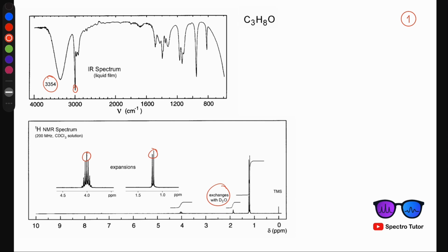From there, if we have the IR spectrum, that's our starting point. IR is especially useful because it tells us about the functional groups present in the compounds. For example, functional groups like a carbonyl, an alcohol, or an aromatic ring will each give distinct signals, as you probably already know if you have passed an identification of organic compounds course or any kind of spectroscopy course in university or anywhere else. So once we've gathered this information, we're ready to move to other spectra.